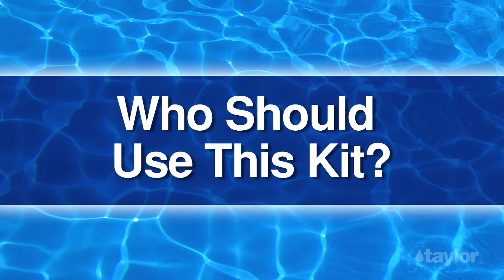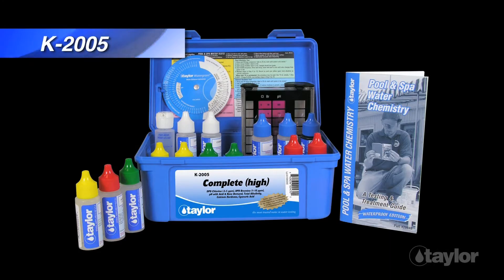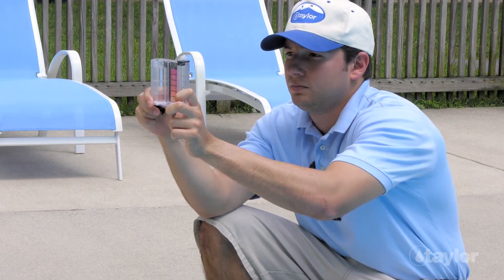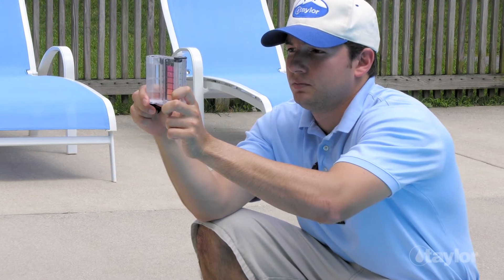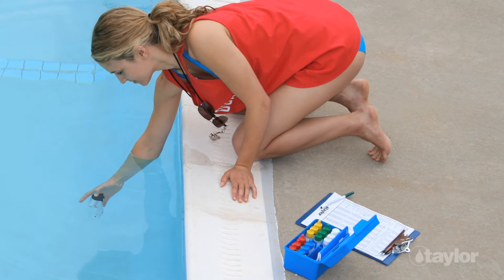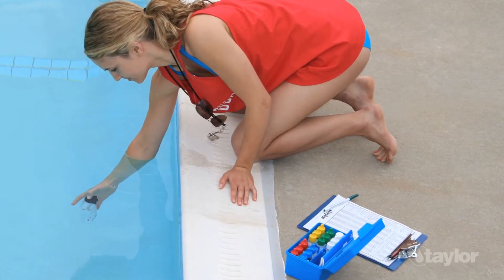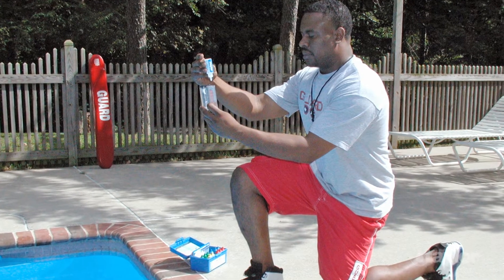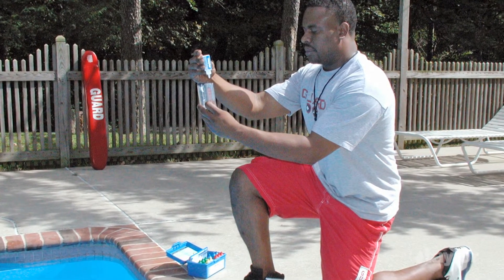Who should use this kit? The complete high test kit, part number K2005, is specifically designed for service technicians, operators of commercial aquatics facilities, health officials, and other professionals whose responsibilities include monitoring water quality in public pools or spas. Homeowners who want to be more exacting about their water testing regimen will also find this kit useful.